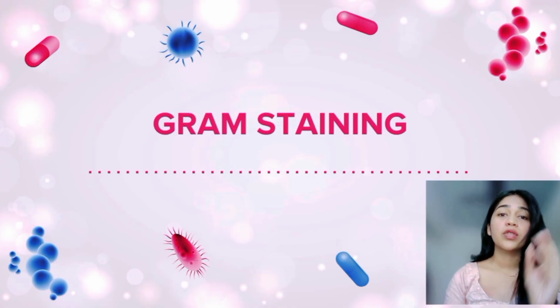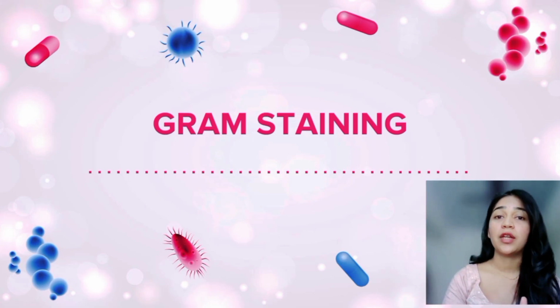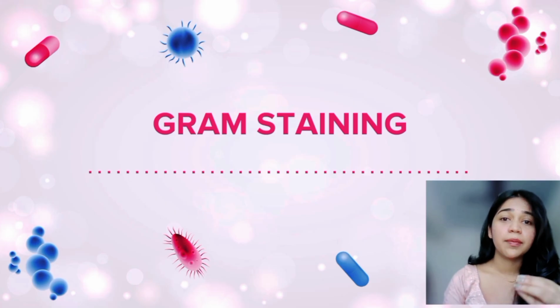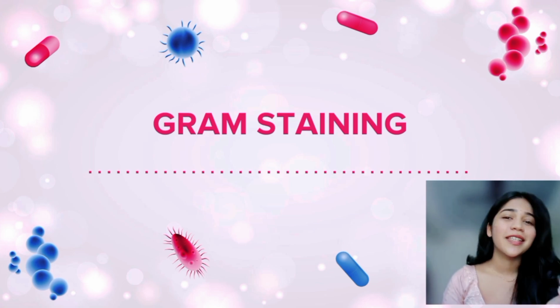Today we are going to study one of the important techniques that we use in the microbiology lab, that is the gram staining technique. Have you ever wondered how microbiologists can quickly identify different types of bacteria using the microscope? This is one of the simplest and most powerful methods around the world, the gram staining process. So, let's get into the video.